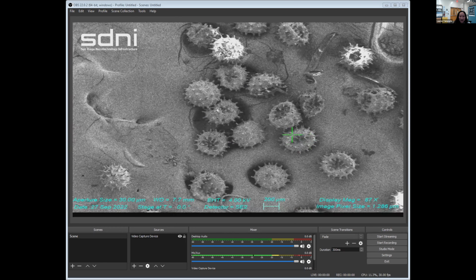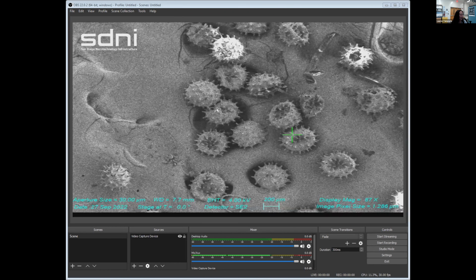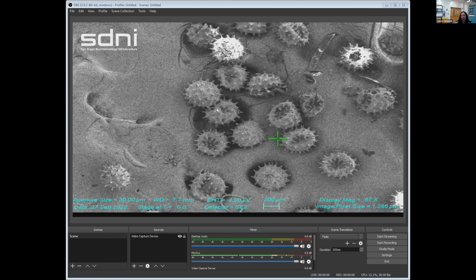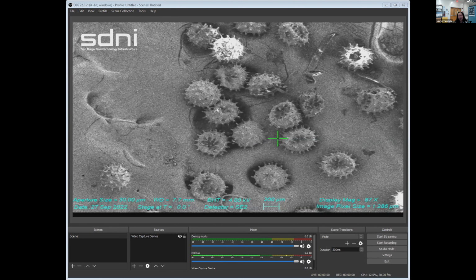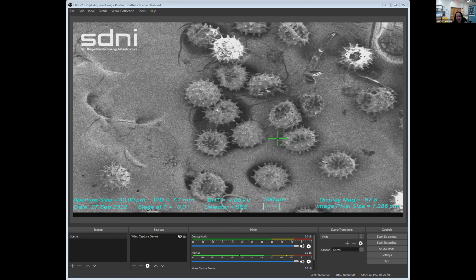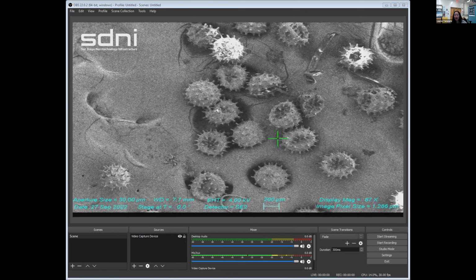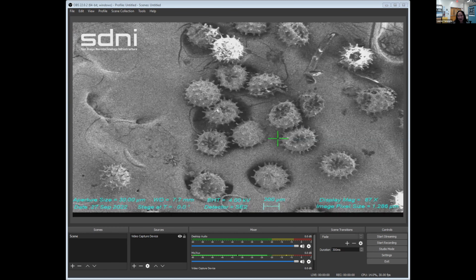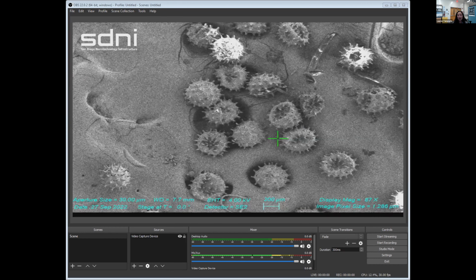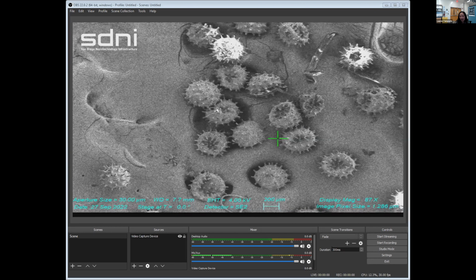So Daniela was kind of on the spot earlier when she said pollen, because now we're looking at some pollen grains over here. So briefly to discuss where pollen comes from and why it's important for plants. There are wind pollinated plants that get pollinated when their pollen gets blown by the wind, and then insect pollinated plants where an active insect goes in and takes it and then drops it off somewhere else. This pollen in particular is from a hibiscus, which is an insect pollinated plant.